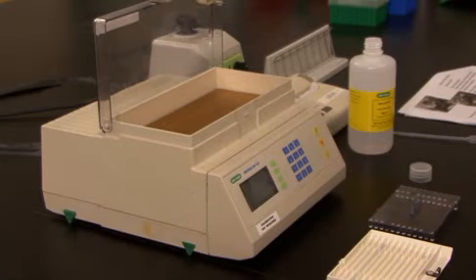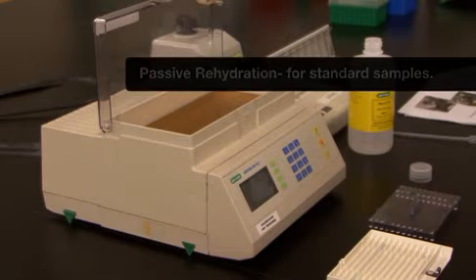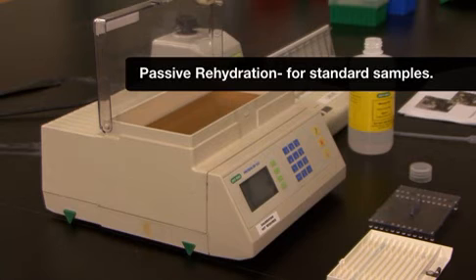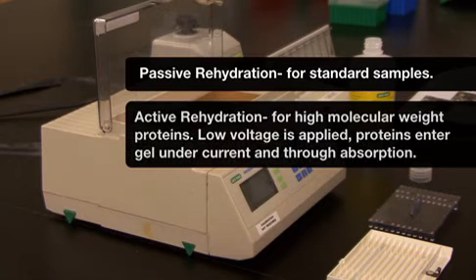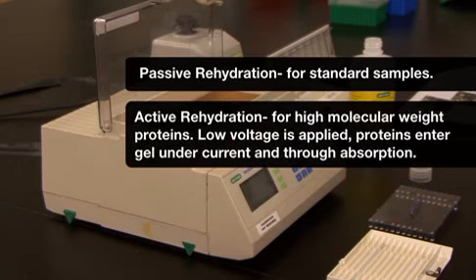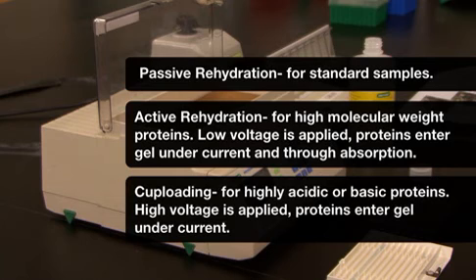The initial step of the first dimension separation is to rehydrate the strip. I will do passive rehydration in the focusing tray. Other forms of rehydration are active, which may be used for high molecular weight proteins, and cup loading, which is ideal for the separation of proteins that will be separated at extreme basic and acidic pH.